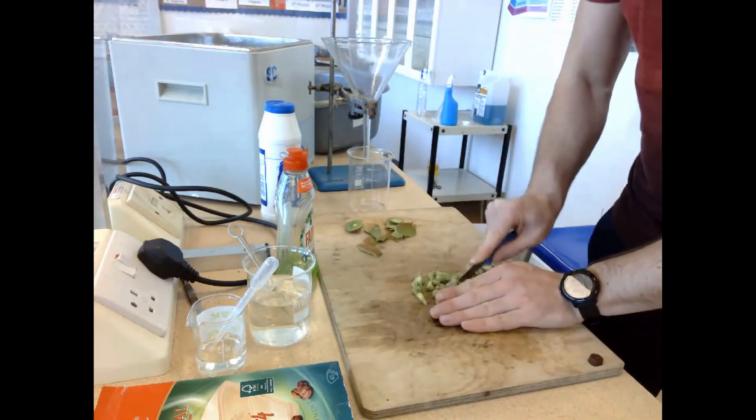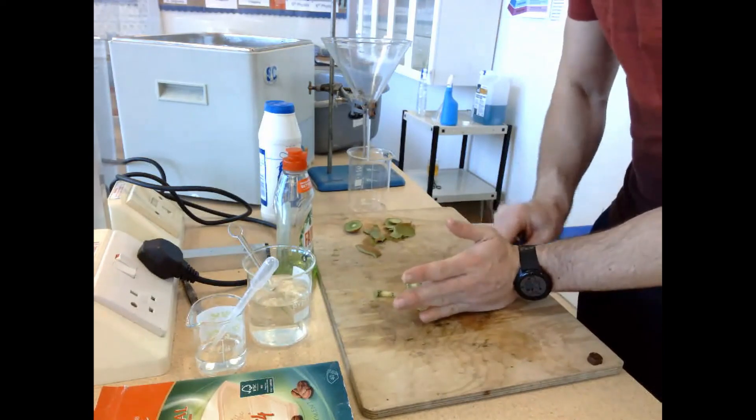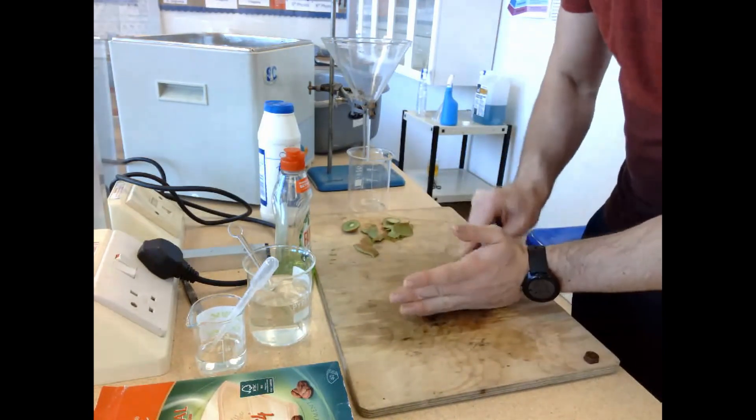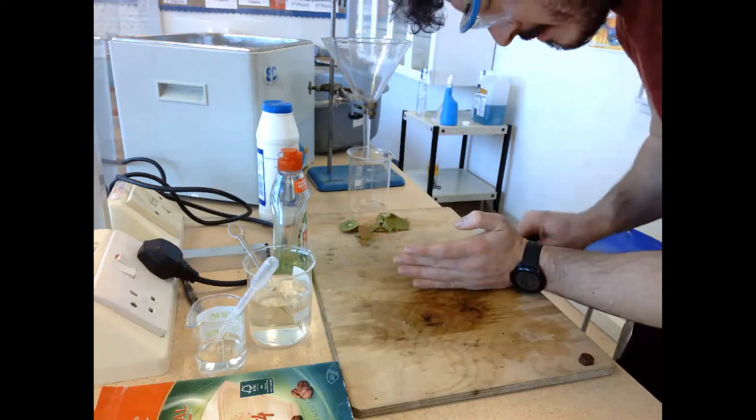So the first thing we do here is we peel the kiwi, and then we start to chop it up. The reason we're chopping it up is to release out the cell contents, because chopping it breaks down the cell walls.